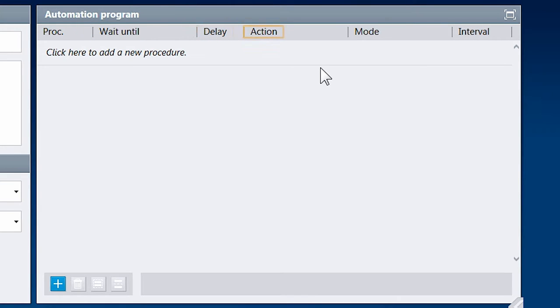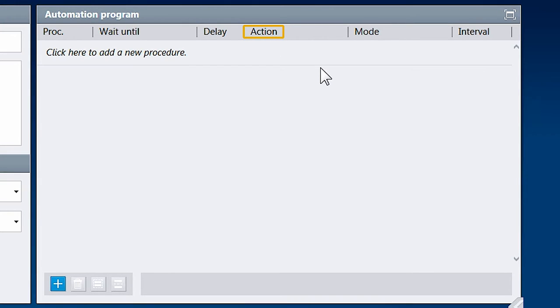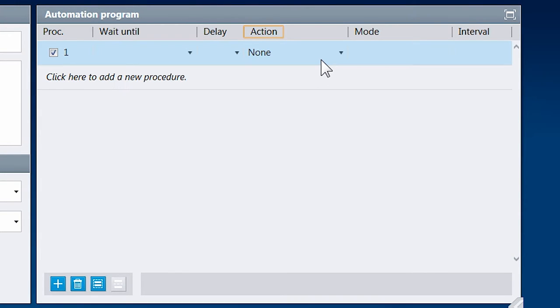Let's get started with a typical automation program for an SFE measurement with the Kruse liquid needle. The action is the heart of the automation program. Actions represent every possible automated process which the instrument or software can perform.